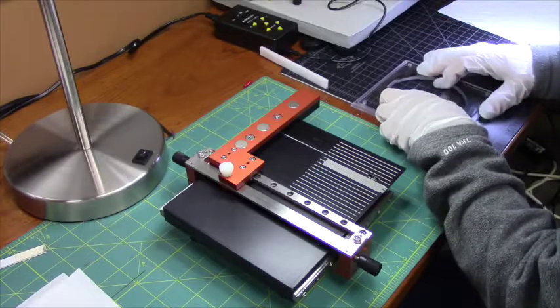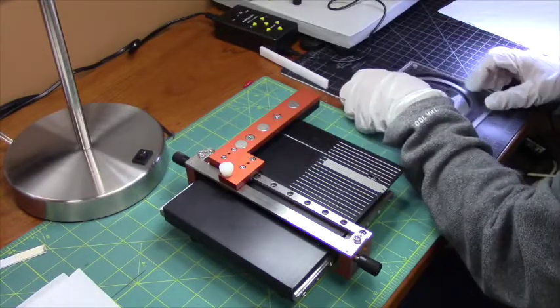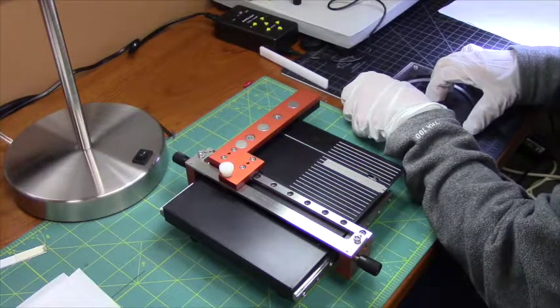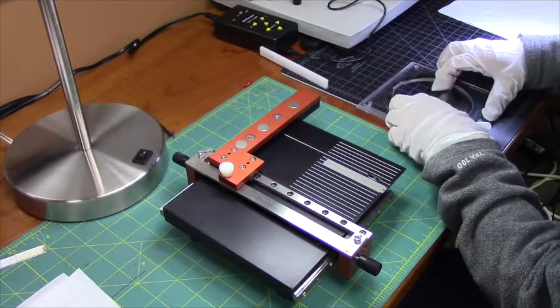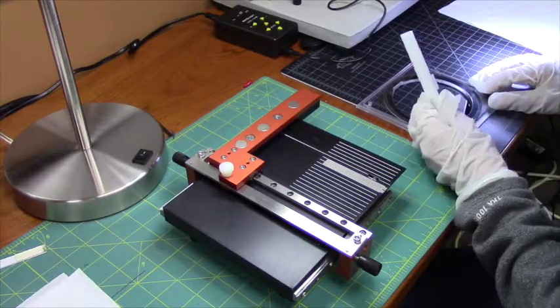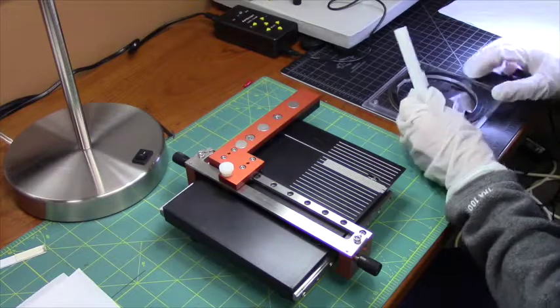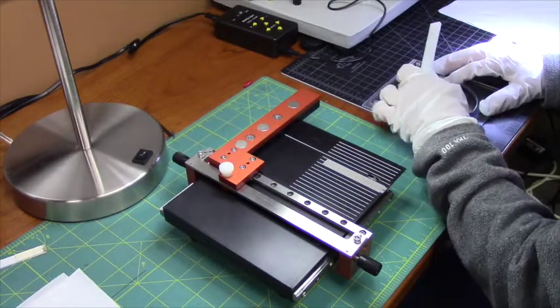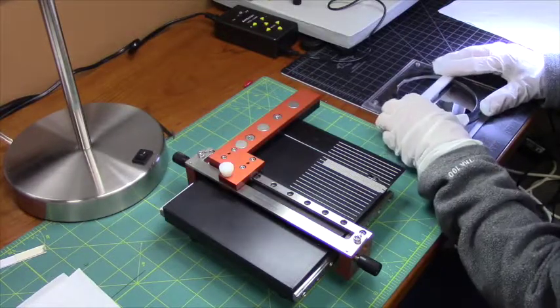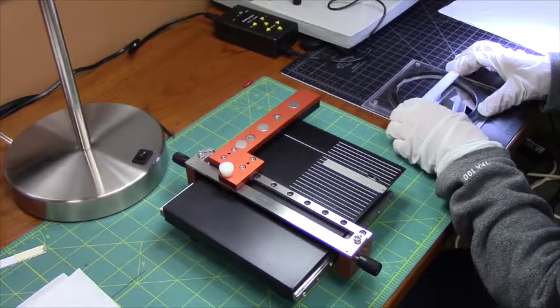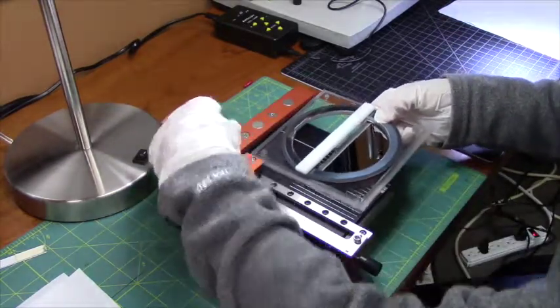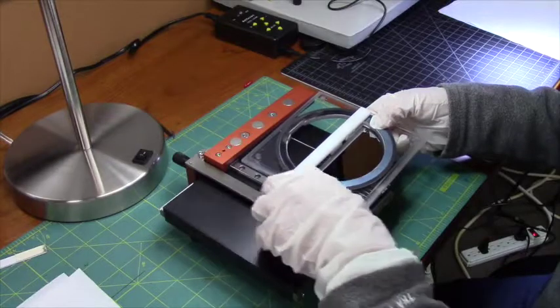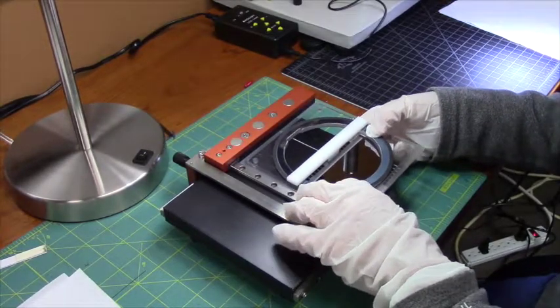This time I am using my cleaving mat to position the sample in the holder. This time I am moving the scribe stop out of the way.